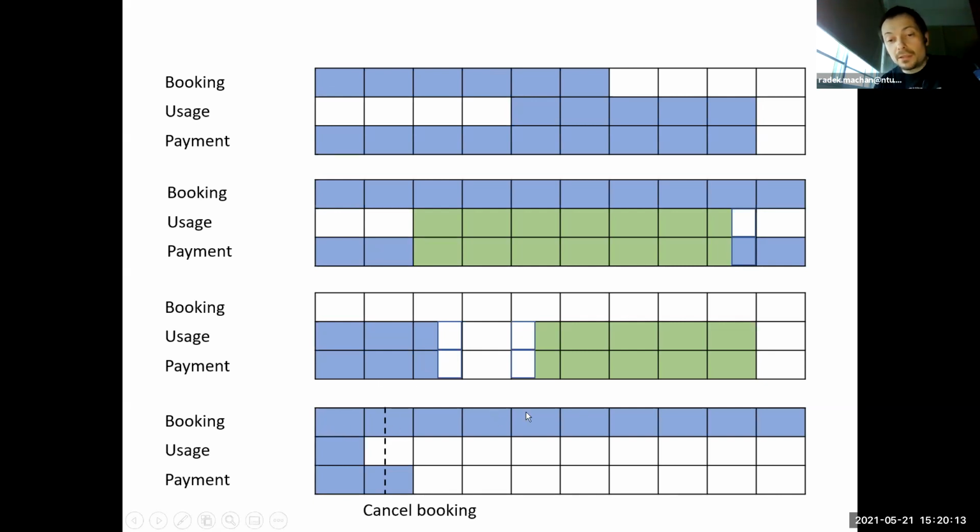And if user A booked a long session, let's say to make a time-lapse experiment, and in the first 15 minutes they found that there's something wrong with their sample, so there's no point in doing the time-lapse, so shortly after that the user cancels the session.